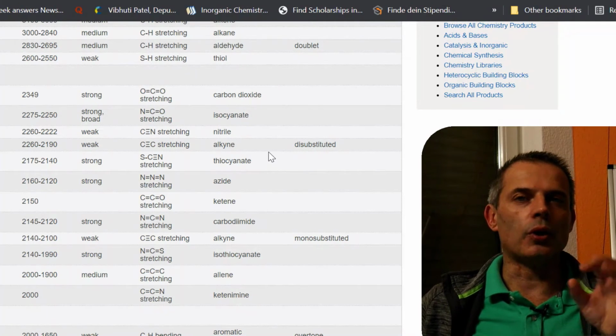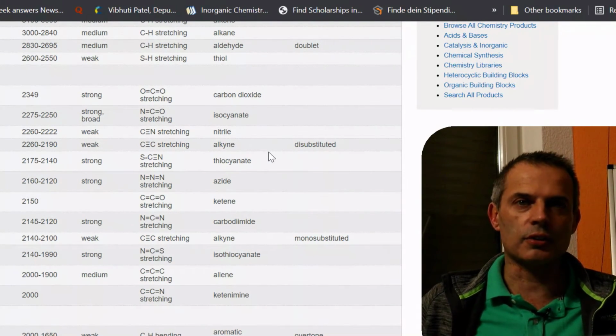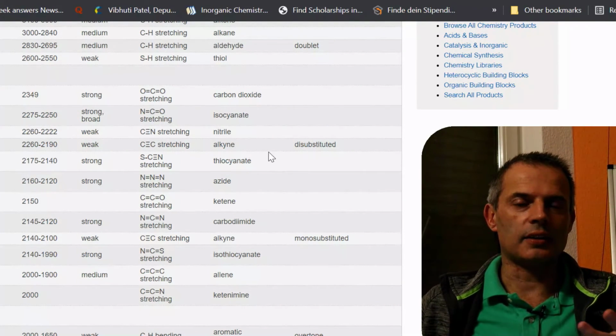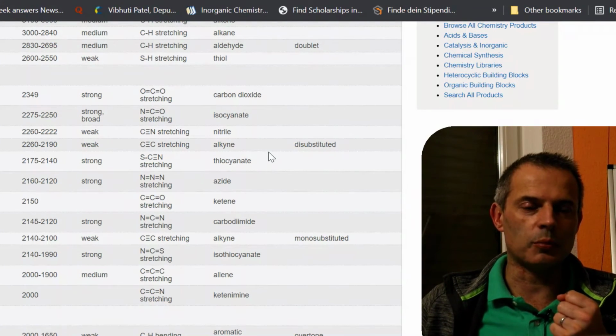And that means that we will often see this peak either positive or negative, depending on whether our reference sample, when we tested the beam, had more carbon dioxide in or less carbon dioxide in than when we do our measurement.